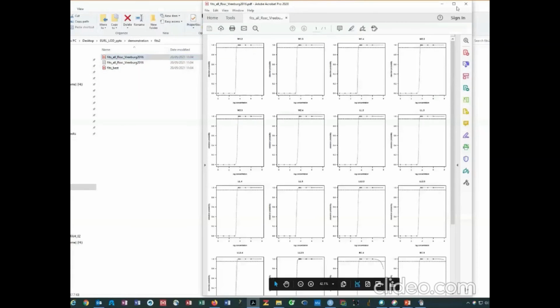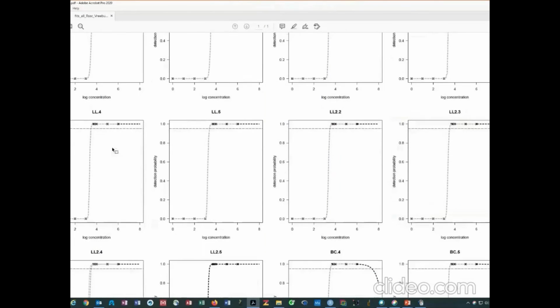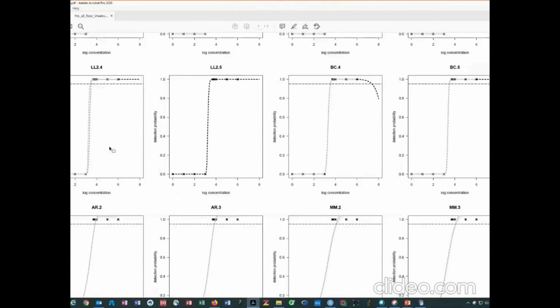So we have the same thing that you saw in the video demonstration. All the different models, these are descriptions of the different models. We were really unlucky with choosing the data. It's not the best to show how different models fit, sorry about that. But for each of the models, you have a graphical representation, and some are better than others.